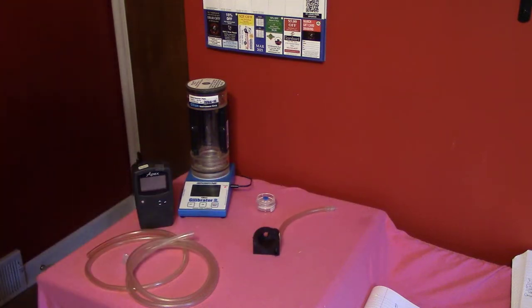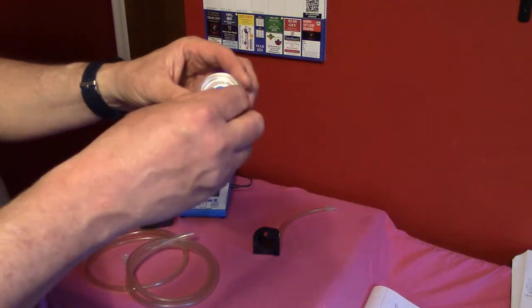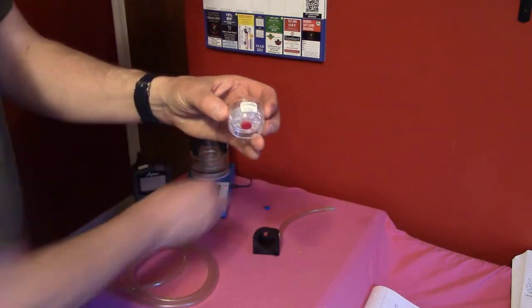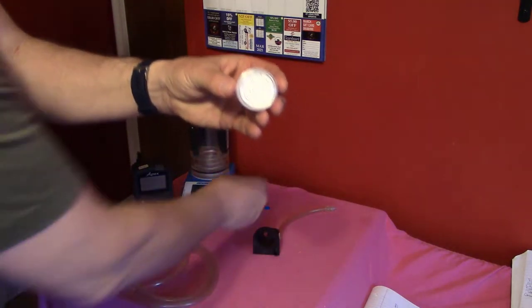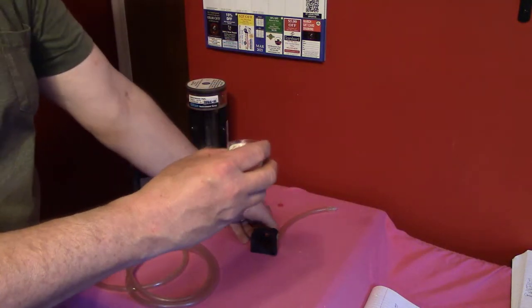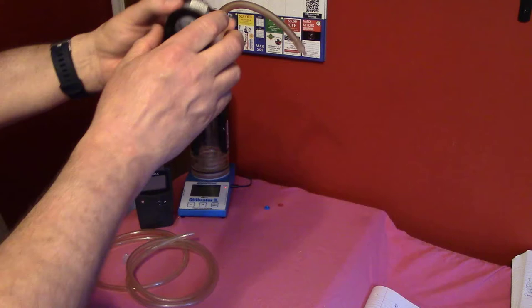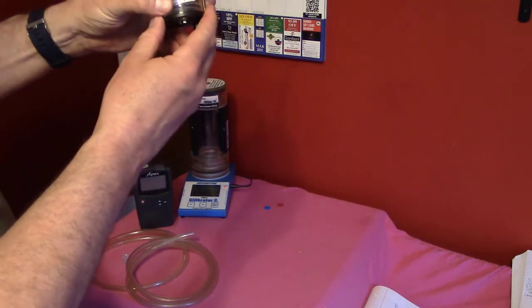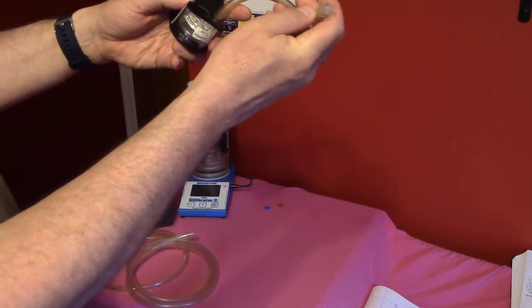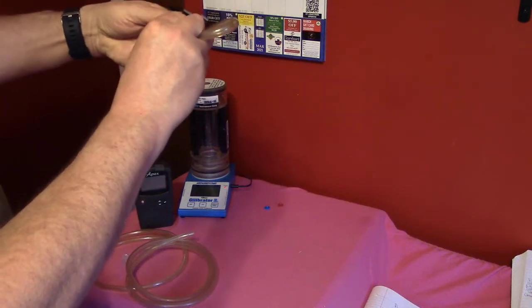The first thing we'll do is put the calibration filter into the holder. We'll take out the caps — first the blue cap from the inlet, then the red cap from the outlet — and then we're going to place the calibration filter upside down into the holder, so the air will be drawn upwards through the filter.